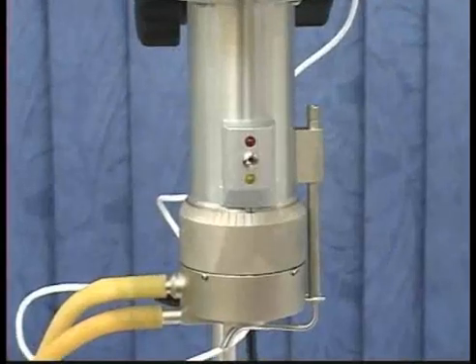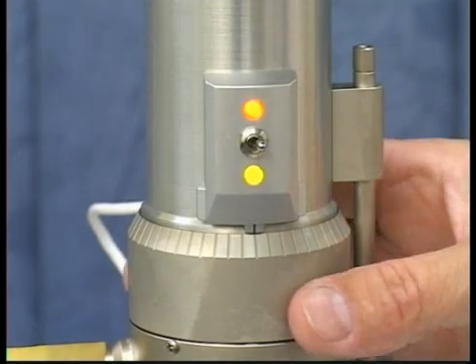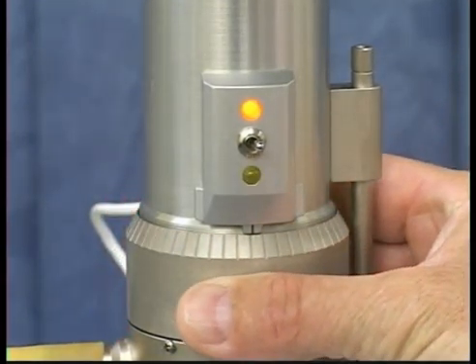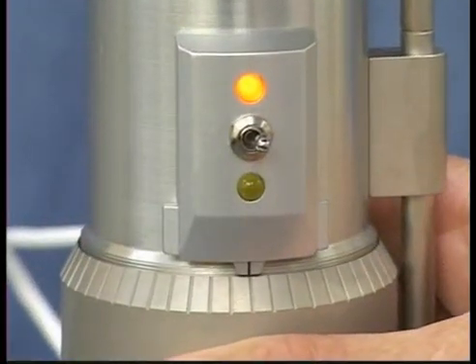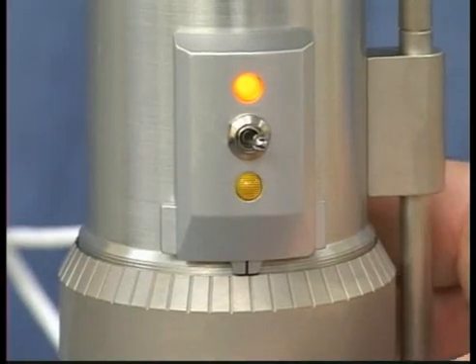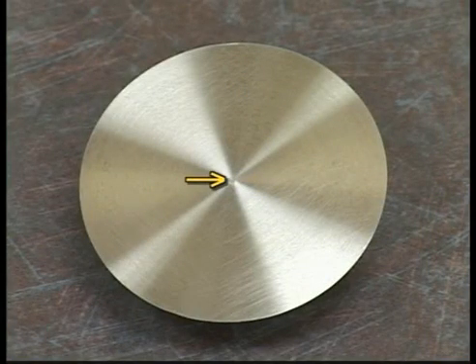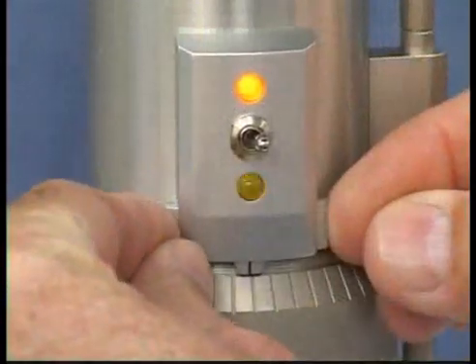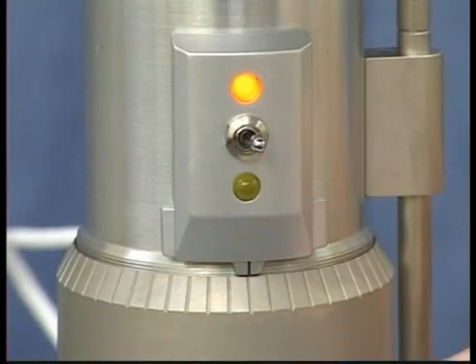Brookfield's cone plate instruments use an electronic gap setting feature. Move the toggle switch to the right and you will see the red light illuminated. If the yellow contact light is illuminated, slowly turn the micrometer ring clockwise until the yellow light is no longer illuminated. If the yellow contact light is not illuminated, slowly turn the micrometer ring counter-clockwise until the yellow light first turns on or begins to flicker. This is the hit point where the pin in the nose of the cone spindle is touching the plate which is part of the cup. Adjust the sliding reference marker right or left to the closest full scale division mark. Then turn the micrometer adjustment ring one scale division to the left to meet the line on the sliding reference marker. The yellow light should go off. You have established the gap.